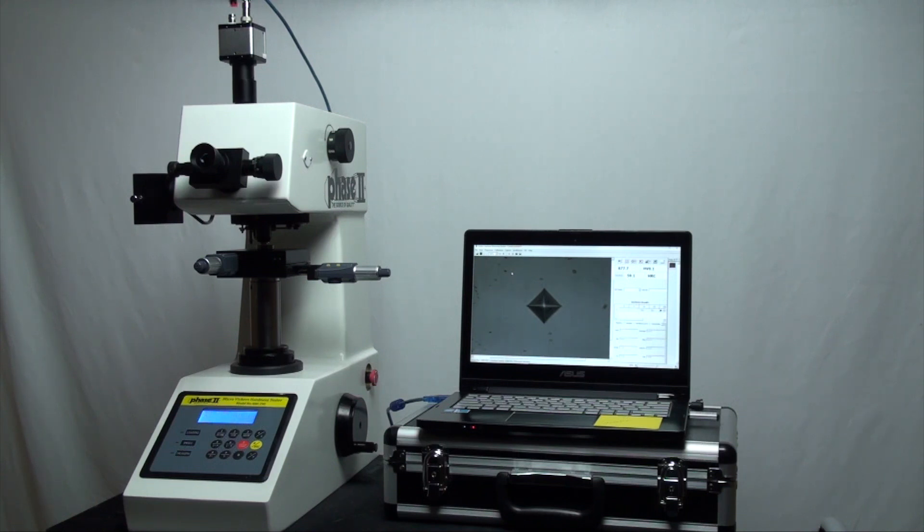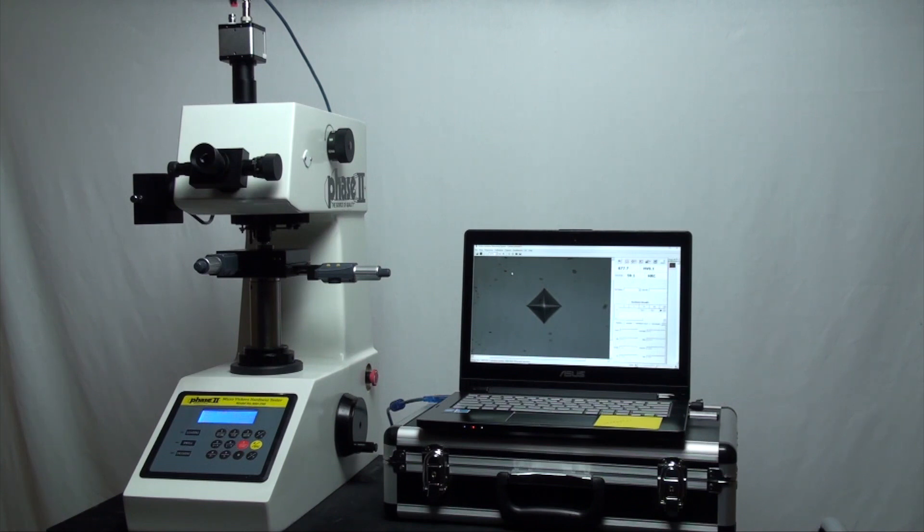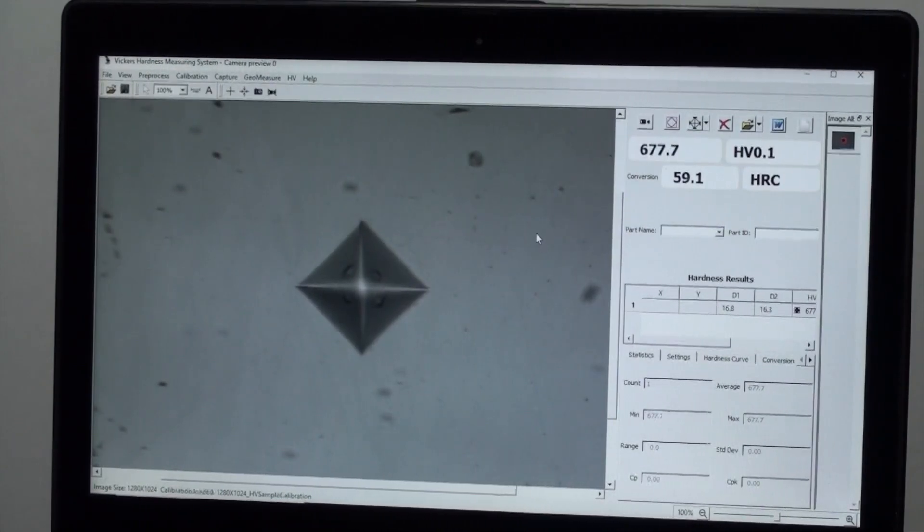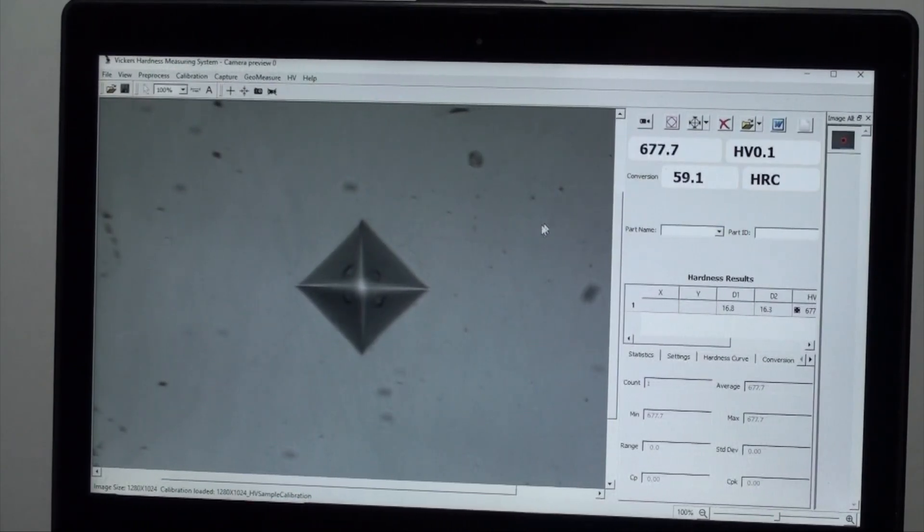However today it is quite rare to bypass the easy use of a computer screen to see the indentations clearly and work with data in a digital format. Let's take a look at the software interface on our laptop here.